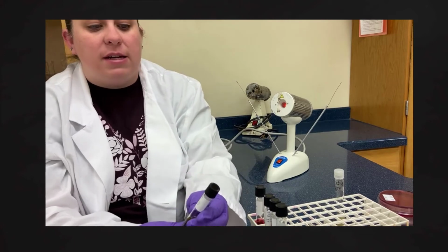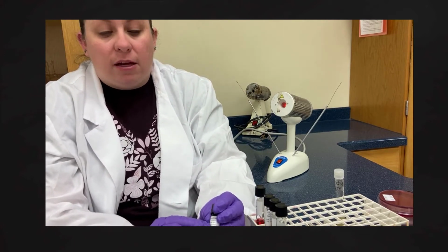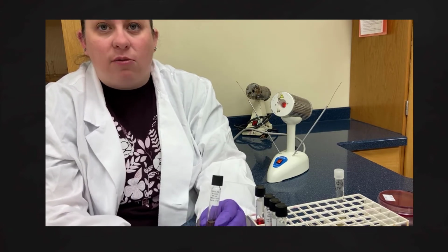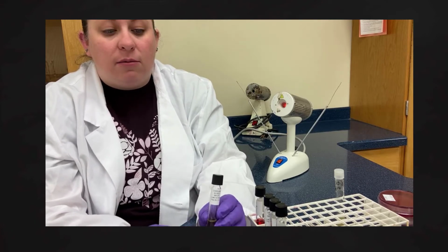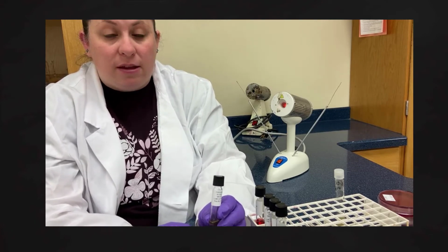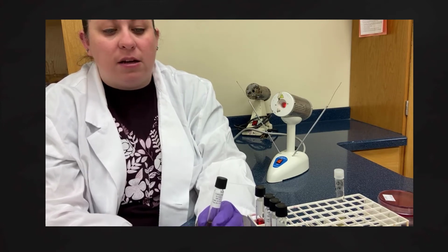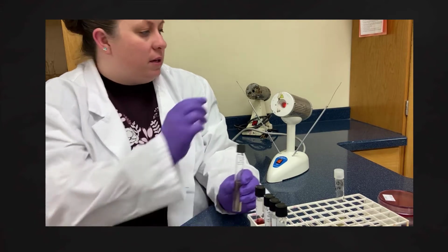This broth right here is a MRVP broth. This is going to be used for the methyl red and the VP test when we talk about a gram-negative type of bacteria. All right, and so we need to inoculate this so that we can run both of those tests with this particular media. Now, this is just kind of a nutrient broth, and we're going to add other chemicals to actually see the test. But in this case, we are going to go through that process.